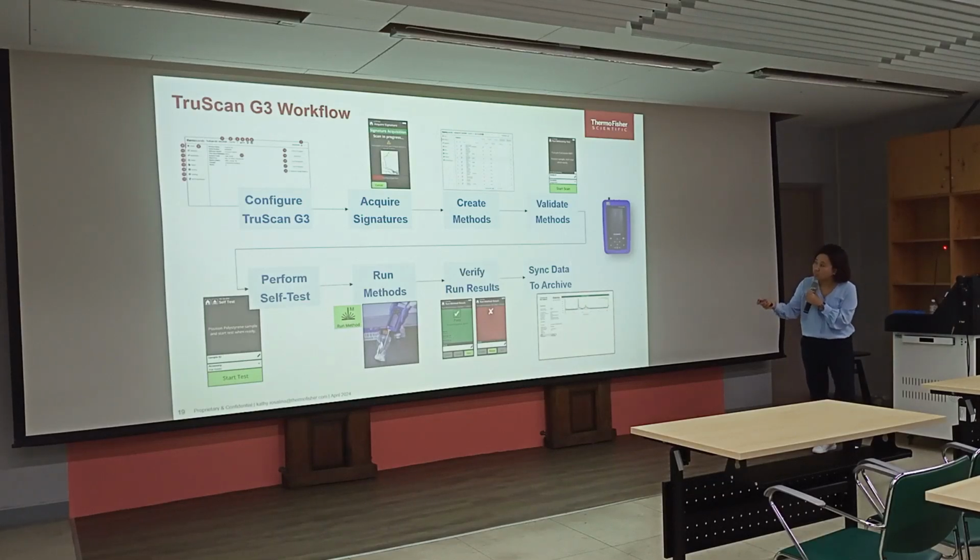So this is the workflow to build the method for when you want to use it for the verifications in your instrument. Later I will share with you. It looks like a lot of steps, but actually it's very simple.